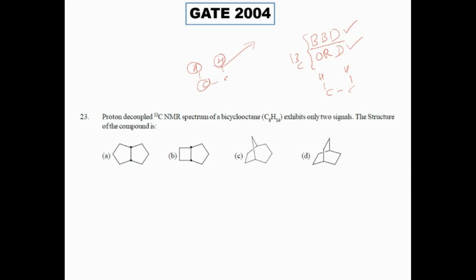So if hydrogens are no longer available for splitting, the carbon gets no hydrogen information, because all the hydrogens are excited away. There is no hydrogen that can share its information for splitting.